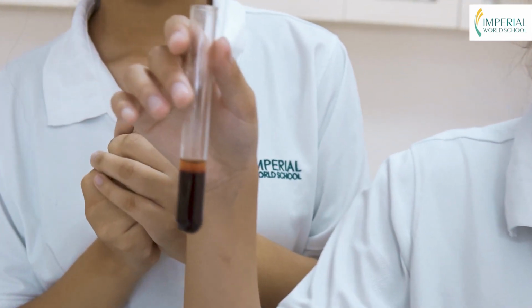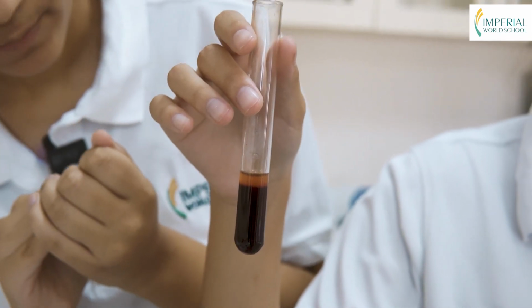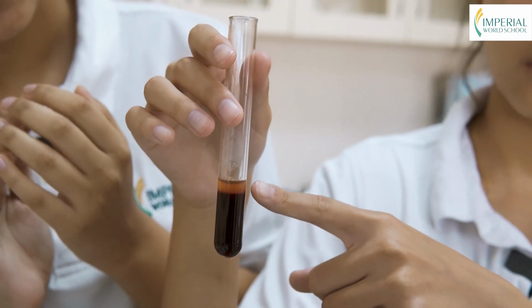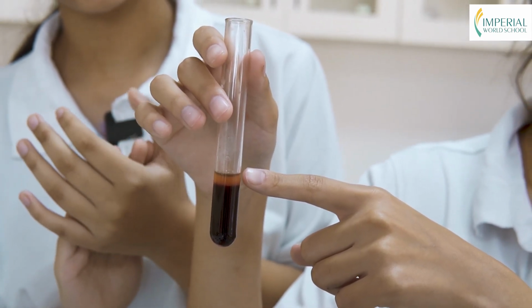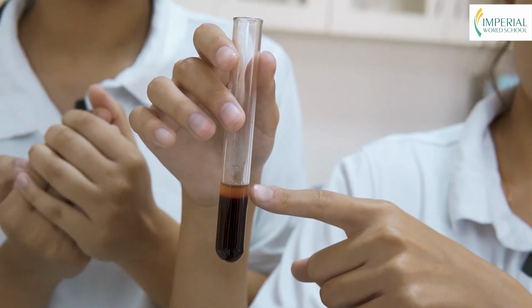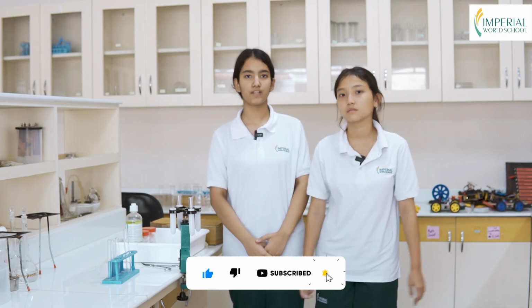As you can see, in the test tube, distinct layers have formed. The bottommost layer is of blood corpuscles and it has a higher density, that's why it has settled below. And the topmost layer is of plasma and it has a lower density than the blood corpuscles, so that is why it has settled above the blood corpuscles. So this is how we have separated the components of the blood.